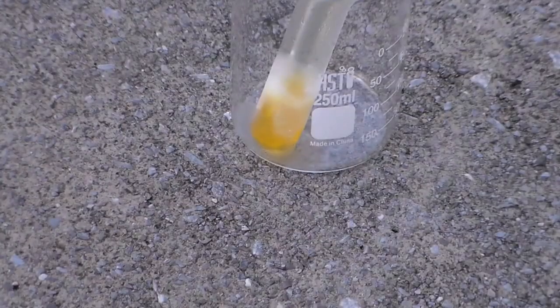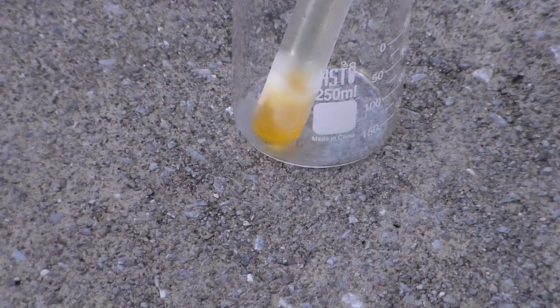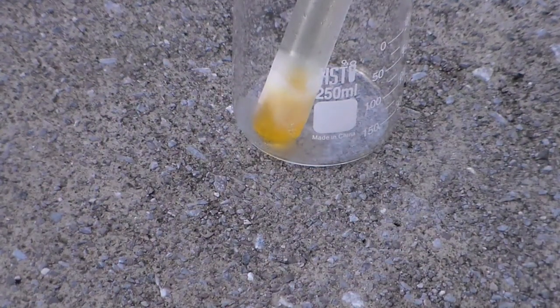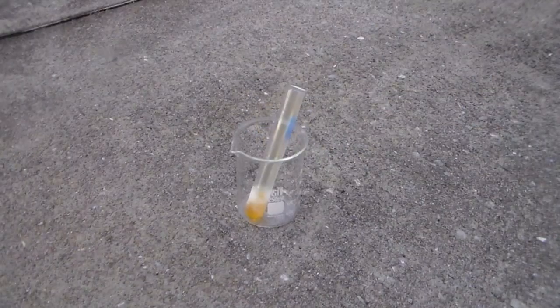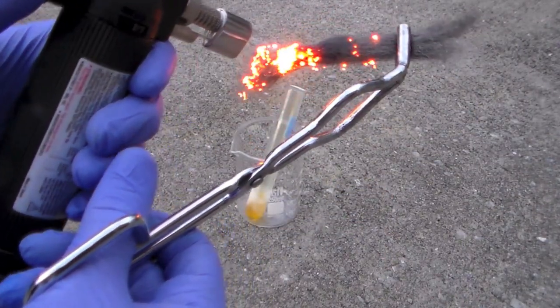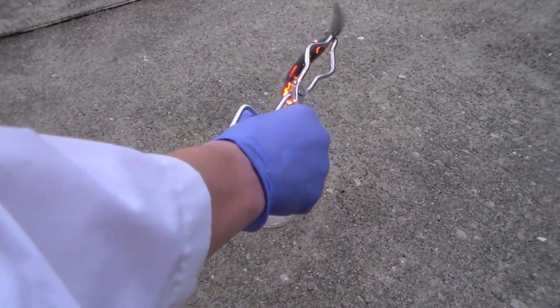I took this outside to do a few experiments with it. You can see that it's already boiling, even though it's only been outside for a couple of seconds. The first thing I tried was reacting it with steel wool. I heated up some steel wool with a torch and then added it to the test tube.